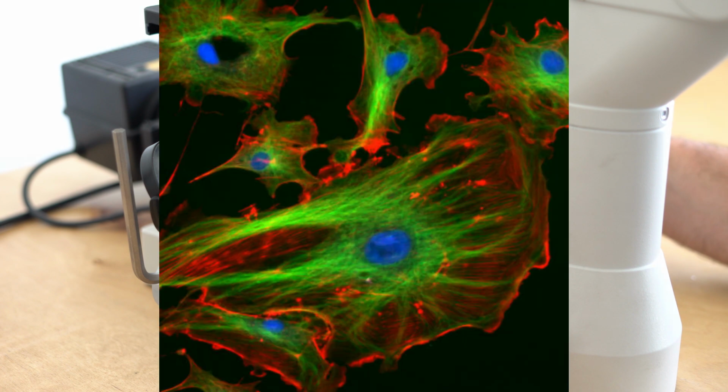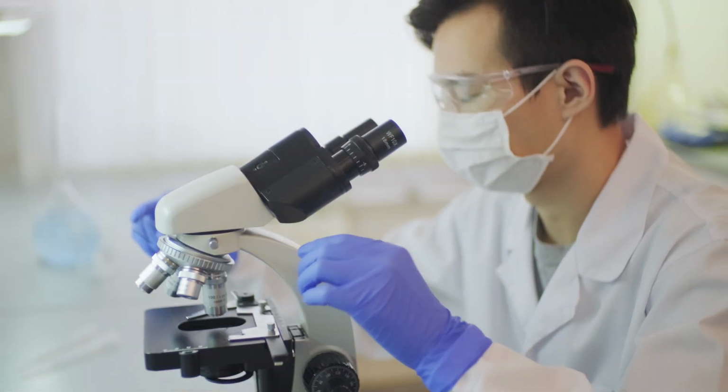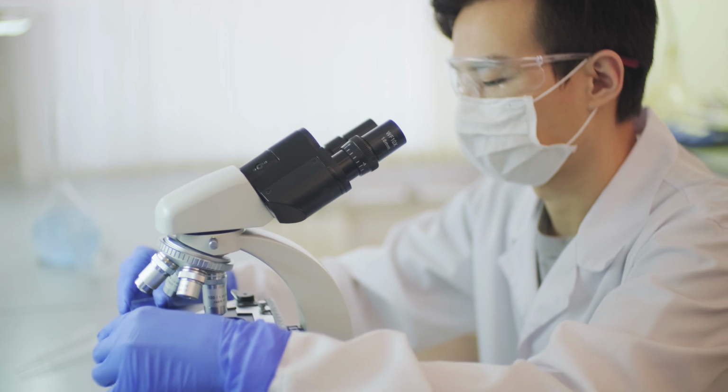There are also other ways to do this, although these other ways, which we'll get to in a moment, overlap considerably with immunofluorescence. That's because you typically have the fluorophore, which is what you're using to stain and therefore be able to see what's happening, attached to something else. Now, not always the target site. Sometimes it's an intermediary. Of course, it's not necessarily the case that you need an antibody. In some cases, you can use another intermediary compound, chemical, or structure to allow you to specifically bind to certain things within your cell or sample of interest.